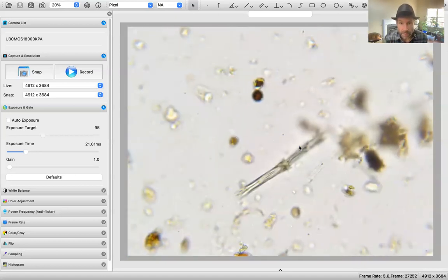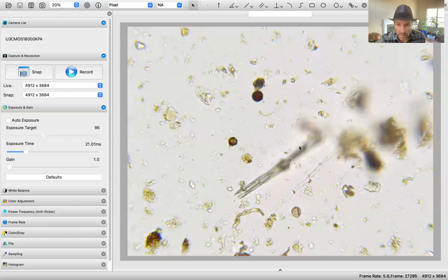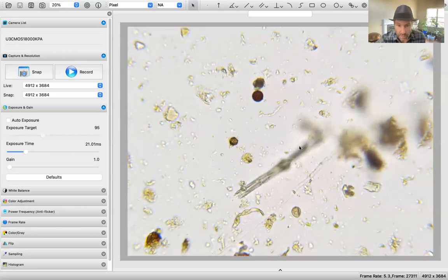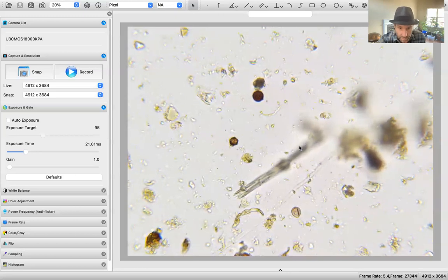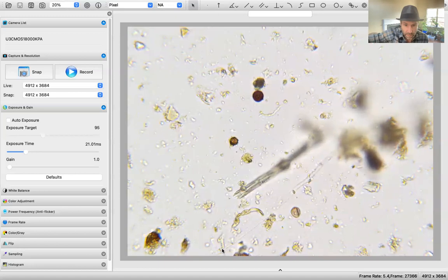That is reading area 3. Get you in focus. Come on, guys. Ooh, there's a hyphae. Yes, sir, indeedy. That's beautiful. Look at that. It's a clear hyphae, and I can see a very strong septa right down here.